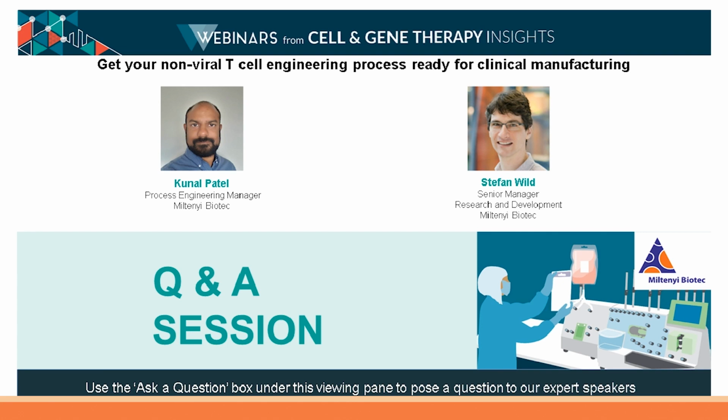And typically, if you're talking about clinical production, you would qualify the system also as a system, and then keep the system together because they have been qualified and tested. So therefore, you would not exchange the instruments during the process runs. Right. I was just thinking out loud while you were mentioning that. I can just hear my quality team and validation team screaming at the thought of that, just because of the qualifications of the instrument for clinical use.